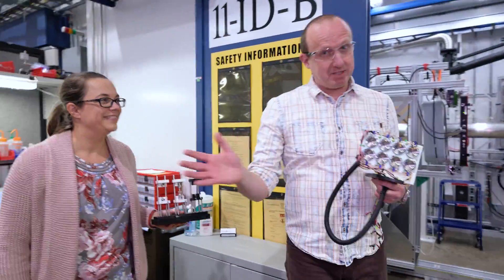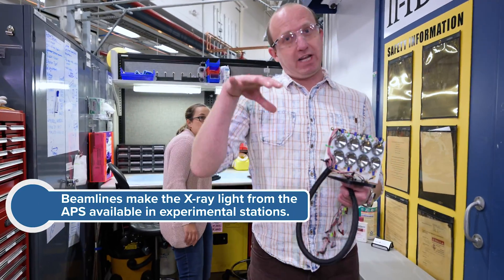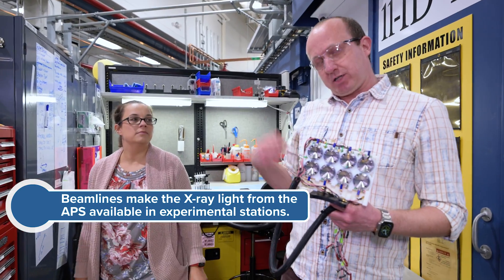And here is where the magic happens. We've built on 11-ID-B, one of the four beamlines we operate here at sector 11, with an additional one at sector 17.